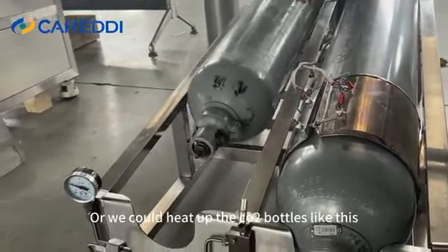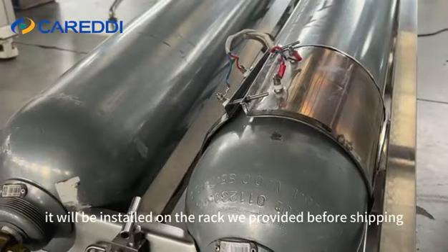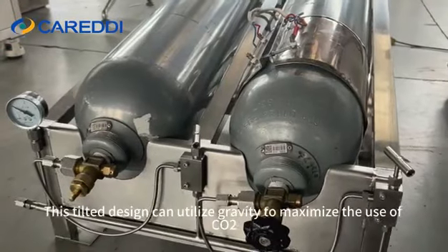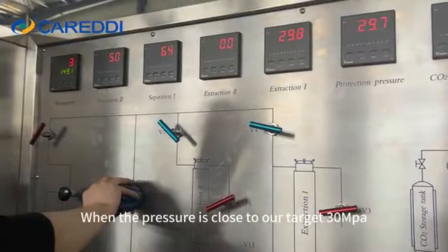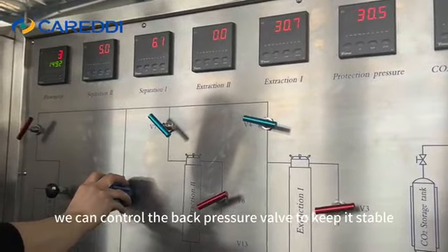Alternatively, we could heat up the CO2 bottles like this — this is a temporary setup, but it will be installed on the rack provided before shipping. This tilted design can utilize gravity to maximize the use of CO2. When the pressure is close to our target of 30 MPa, we can control the back pressure valve to keep it stable.